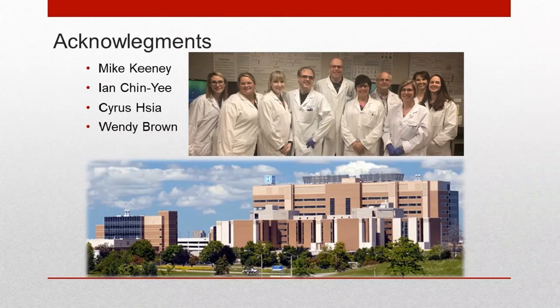And given that the CD34 does cross both, and the DR and the 13, you could probably quite easily match between the tubes and hopefully locate your residual disease population. So yes, it is possible, but no, it is not part of the actual product being discussed here. But definitely an off-label use potentially.